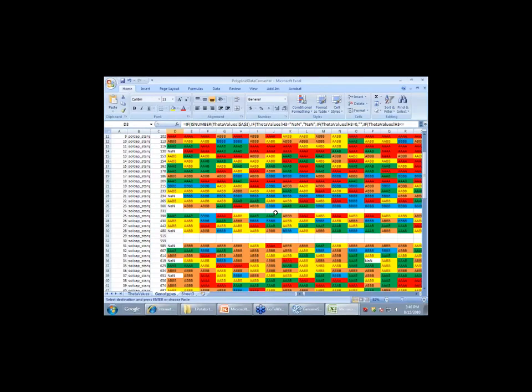But we've chosen the SNPs, for the most part, to represent as many genes as possible, except for the candidate genes that people are interested in, where we may have chosen more than one SNP within those genes. So a lot of the haplotype part is actually defined by how you pick your SNPs, based on your sequence data. So that's in a sense before this.